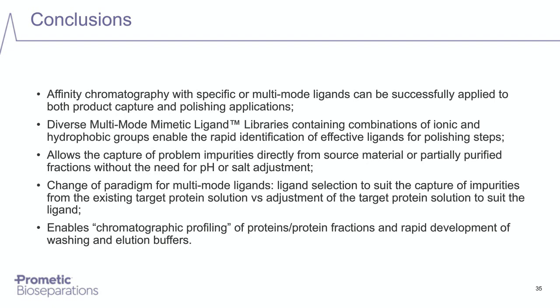So this is really a change of paradigm now for multi-mode ligands. So rather than spending a lot of time and effort in the lab to optimize the feed material so that we have binding of either the target or the impurities, what we now do is simply take the feedstock as it is, run it through the columns, and select the ligand that provides the binding properties that we desire.